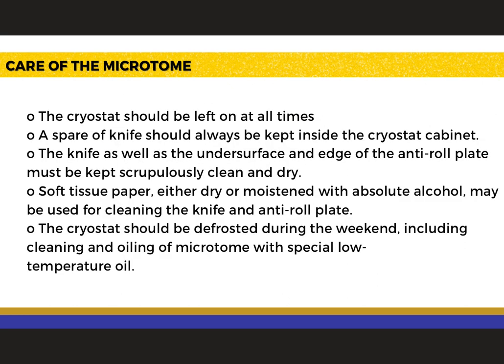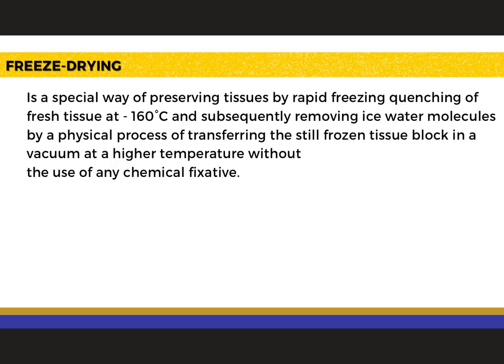So here are some important points with regards to care of your microtome. So please go over this slide. So now let's go to some special processing techniques.